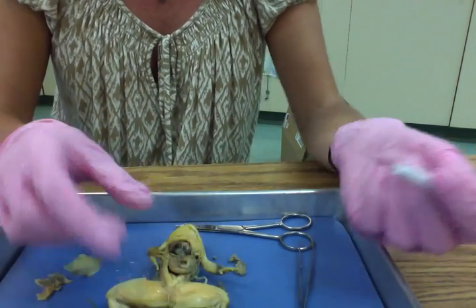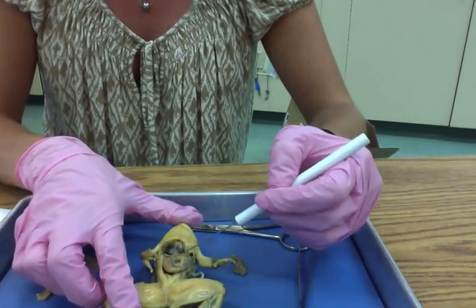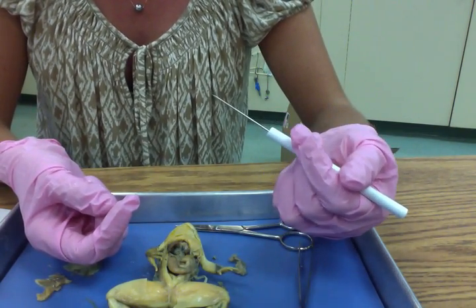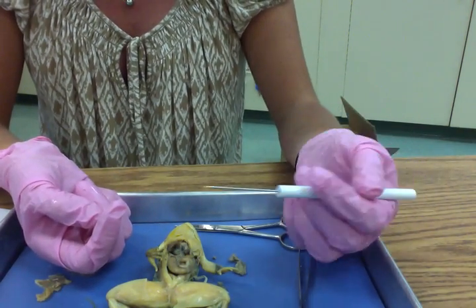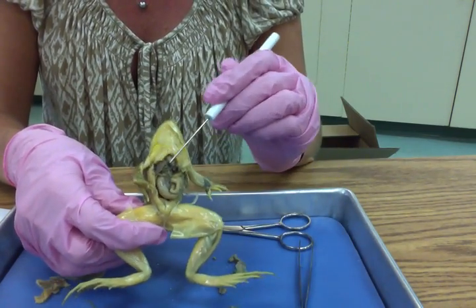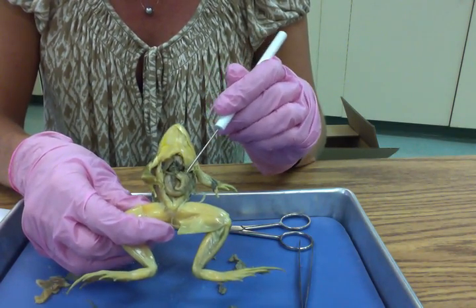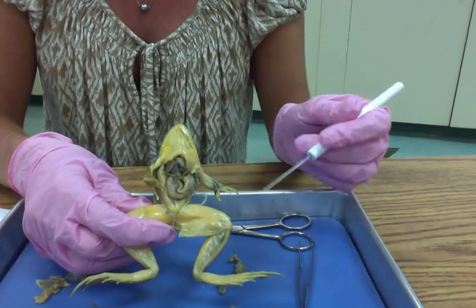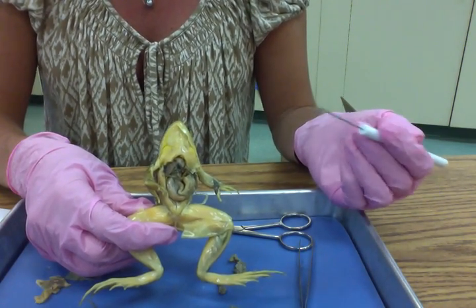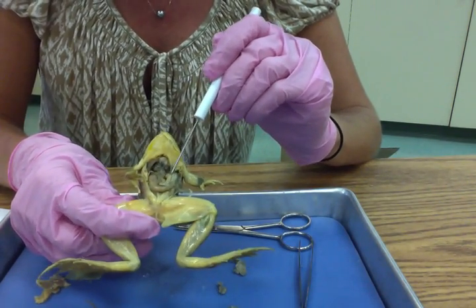So humans, we store fat subcutaneously or under our skin. And we know that fat is good to some extent. It provides us with energy. It's an extra source of food for our body. But frogs, as we notice, they don't have much fat. They're all muscle. And so their fat is stored in these fat bodies. And that gives them an extra supply of energy while they're hibernating or for females when they're breeding, things like that. So their fat is stored in fat bodies.